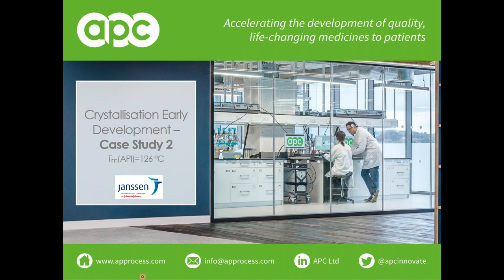So as I said, for screening purposes, I think if we select the right solvent, that's good enough. The in silico screen gave us isopropanol as the best. And then when we explored a number of solvents, we actually got quite similar results. So there was a low solubility at 20 degrees, but a very high solubility at 50 degrees. This was predicted by COSMOtherm and also confirmed by experimental results. So I think that's a good match. If you are asking me about the accuracy, usually in our experience the error is maybe even 50 to 100%, but I think this is still good enough for screening purposes.